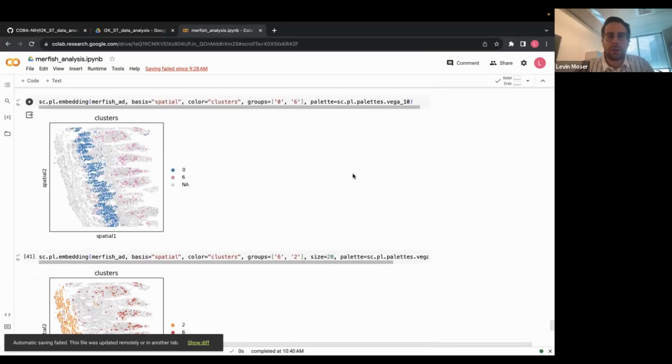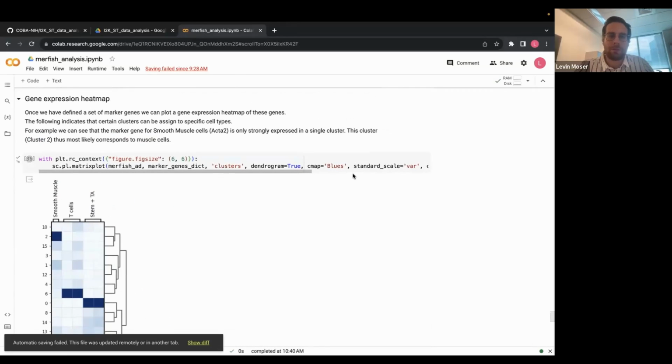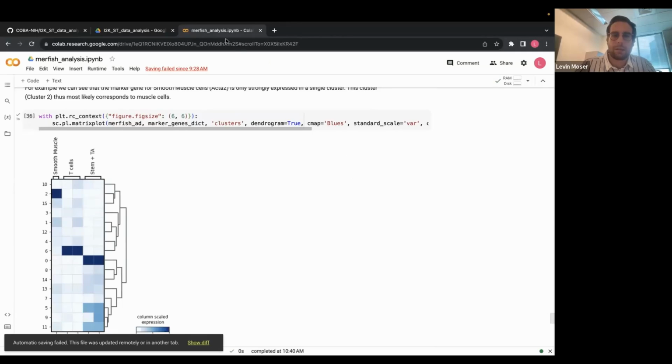Yeah. Maybe another question: is there a way to import a list of cell IDs to subset the regions, and compare subregions using the same or overall clusters from the initial analysis?